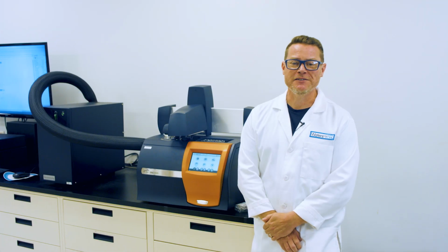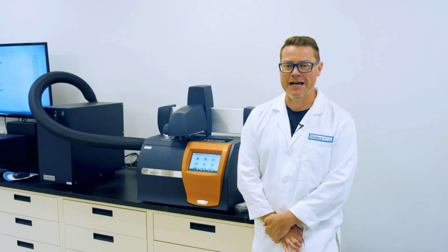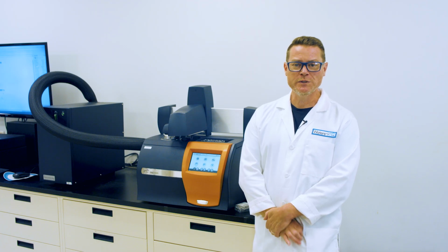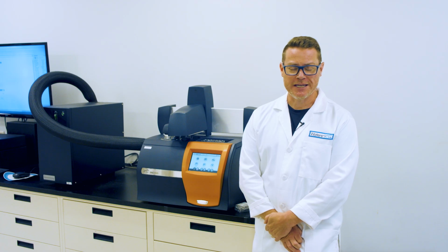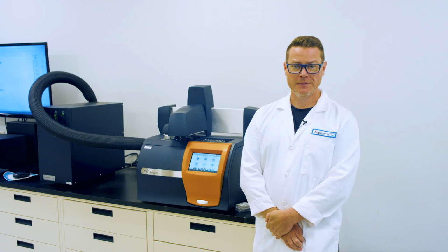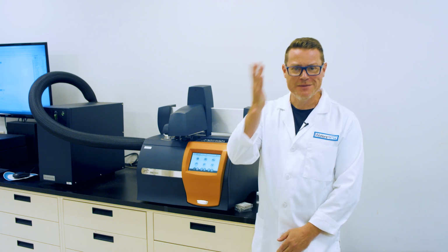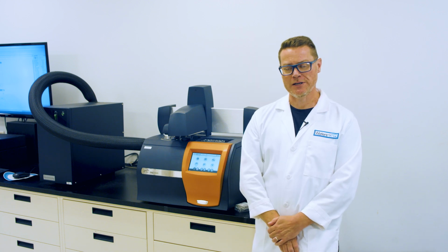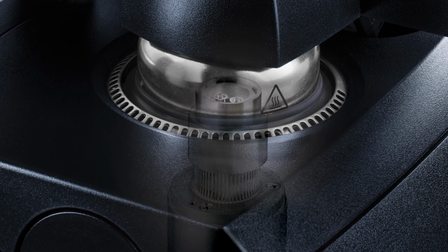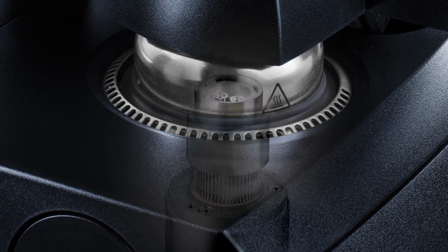Since this is an explainer video, I'd like to take a moment to explain briefly how a DSC actually works. All DSC instruments need to be able to change temperature. To increase temperature, a heater is needed. For some reason, these are referred to as furnaces, which in my mind makes me think of an industrial steelmaking plant. But in reality, the furnace is a small electric heater mounted under the sample and reference.